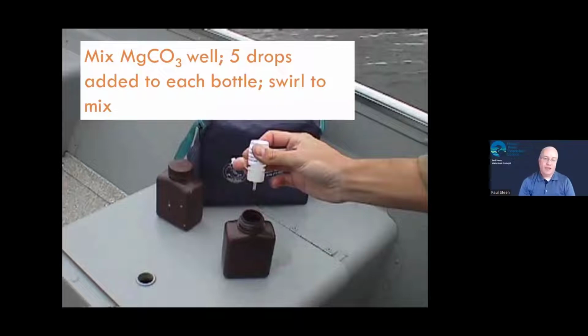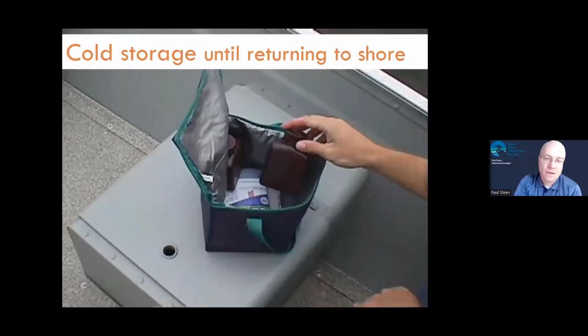When that's nicely mixed, add 5 drops to each one of those amber vials, cap them, and swirl the amber vials gently to get that distributed inside. This is a preservative, and it starts stabilizing your chlorophyll so it doesn't break apart. And then you can put those in cold storage until getting back to shore.